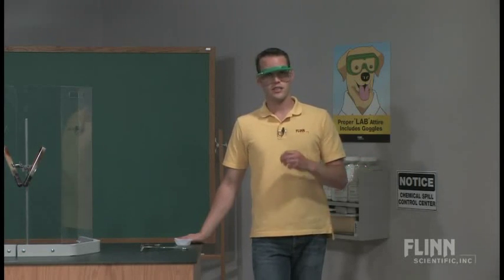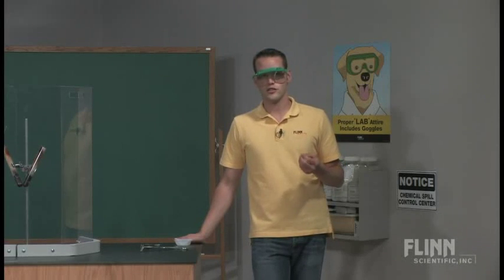oxygen. You can also tie in the nice combustion reaction because of the very high concentration of oxygen that is generated by this reaction. You get a very, very fast combustion, a very fast burning of these, where if you just tried to burn them in air, they would kind of smolder. So you can also tie this into kinetics and talking about the effects of concentration on a reaction rate. The high amount of oxygen causes the reaction to go faster.